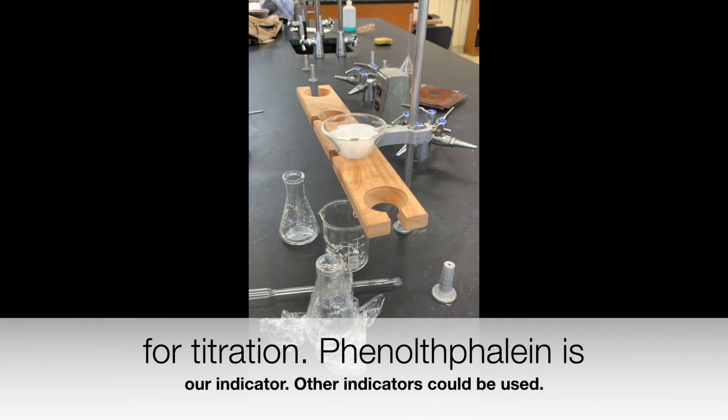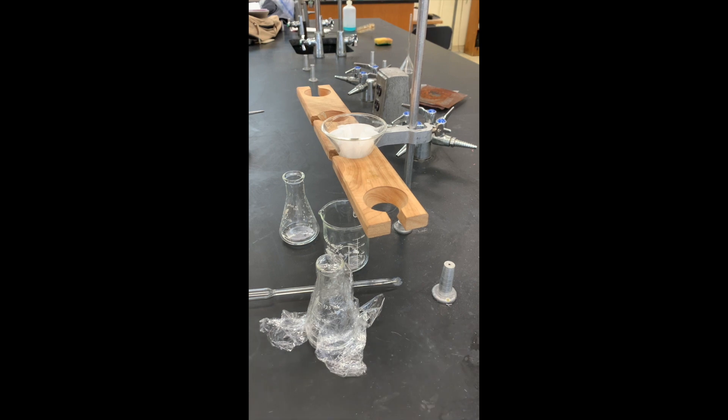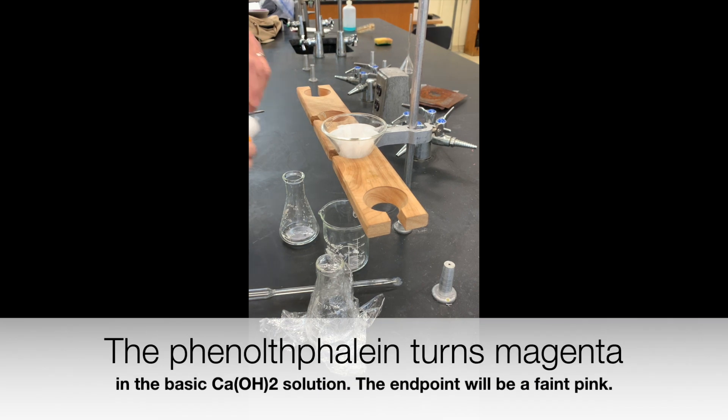Phenolphthalein indicator and about 25 milliliters of water are also added. Other indicators could be used. The phenolphthalein turns magenta in the basic calcium hydroxide solution. The endpoint will be a faint pink.